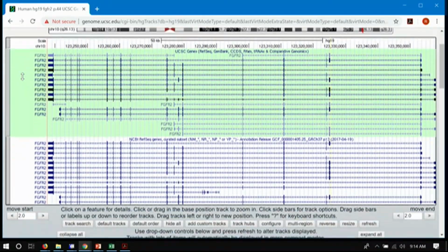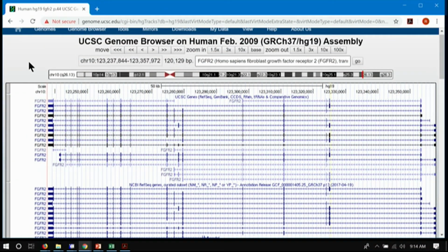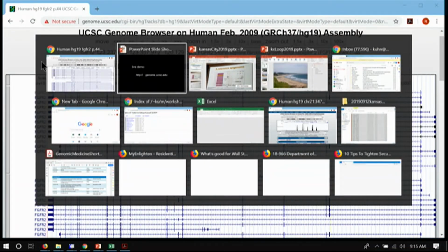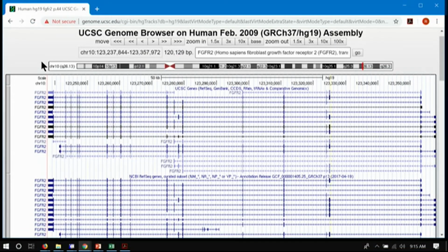Whoa, is it broken? It might be broken. It's supposed to be highlighted. All right, so in theory, it won't necessarily be the top one, but if you do it like that, it should highlight it. In fact, let me make a note here. Did other people have it highlighted? Yes. Okay, so what kind of browser am I using here? I'm using Chrome. Okay, that's good to remember. If you do write to us with a bug, it doesn't hurt to tell us what genome assembly you're on and what browser you're using, because we're probably going to have to write back and ask that.